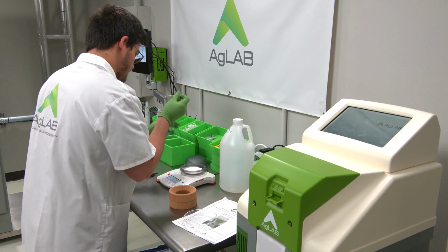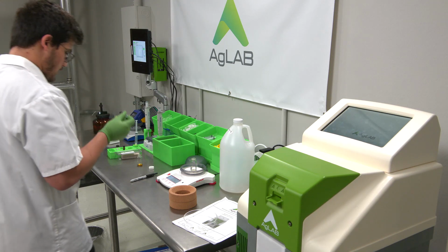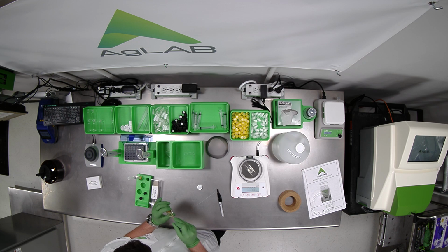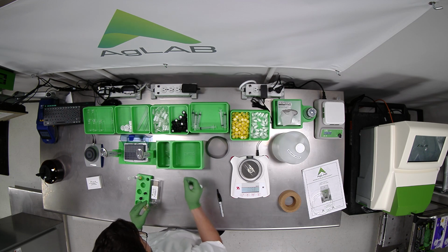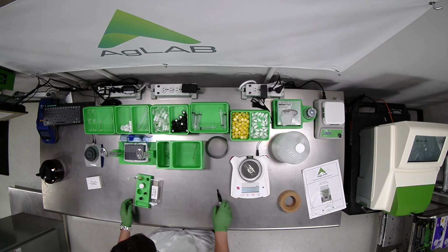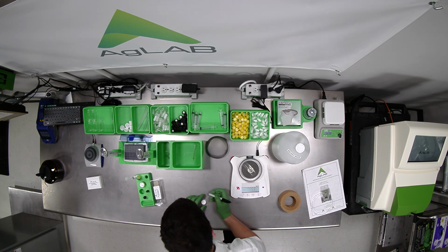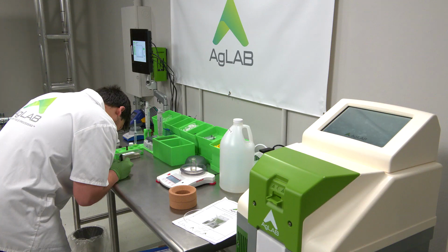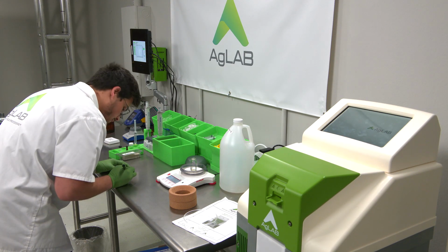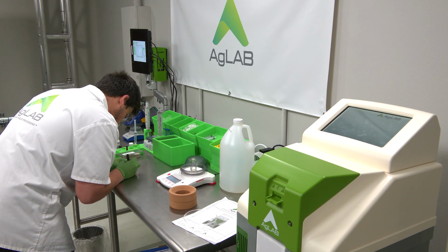Okay, just touching it to the side of the glass there. And that looks good. So anytime you're happy with your weight and you're ready to cap your vial, you want to make note of the amount of material that you just added. For me, I prefer to write it on a cap. So this is stage 1, distillate 1, our vial D number 1, and we have 0.053 grams.